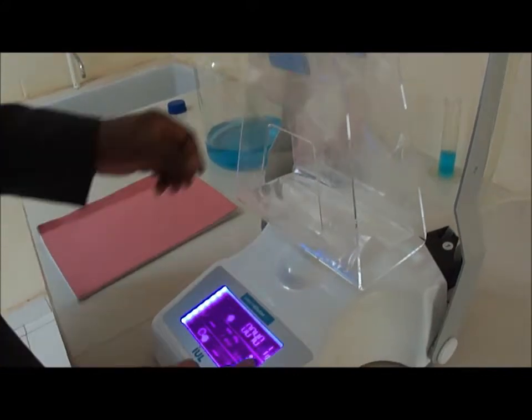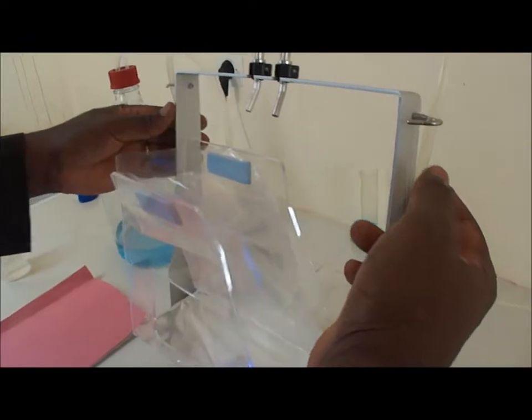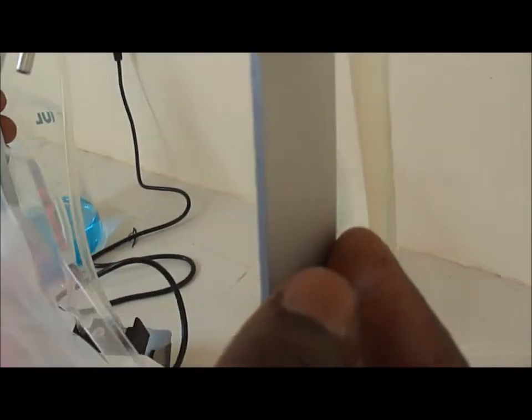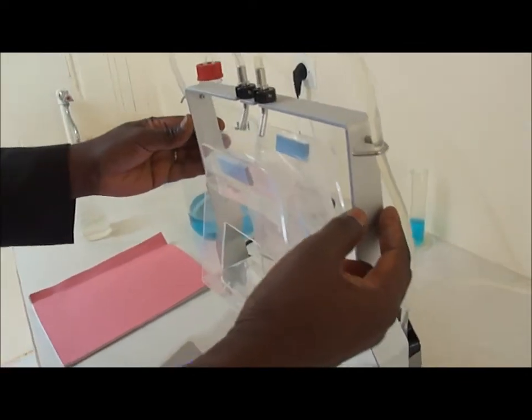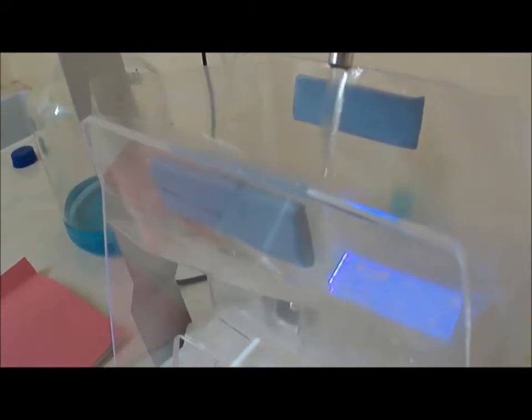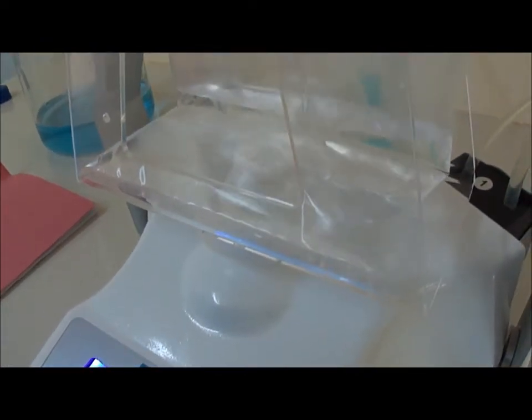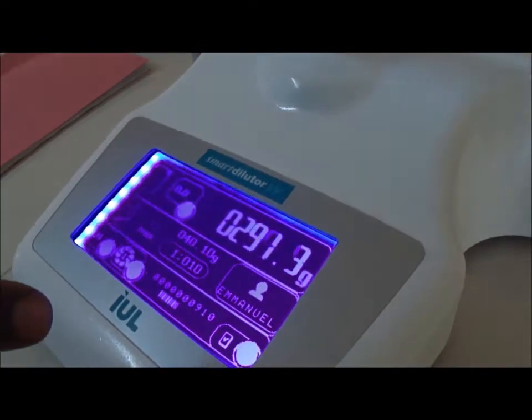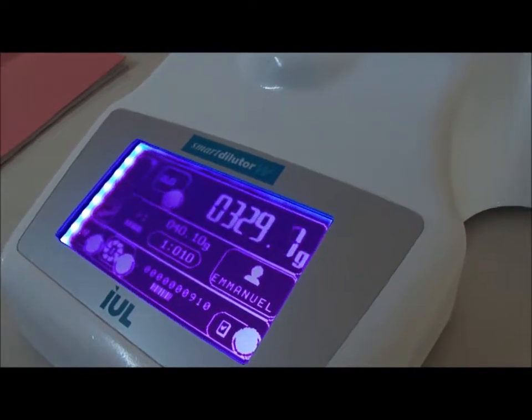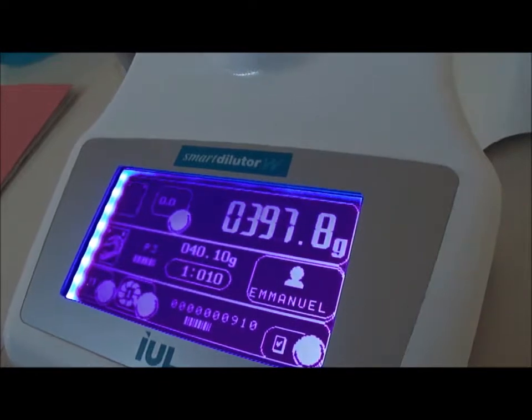To trigger, to start the dilution process, I just pull forward the frame, the metallic frame. And then, at a certain moment, it starts pumping and putting water inside. Look at the screen, it's changing, 200 now, 240, 250, 260, etc. It should stop somewhere around 400 grams. Yeah, that's it.